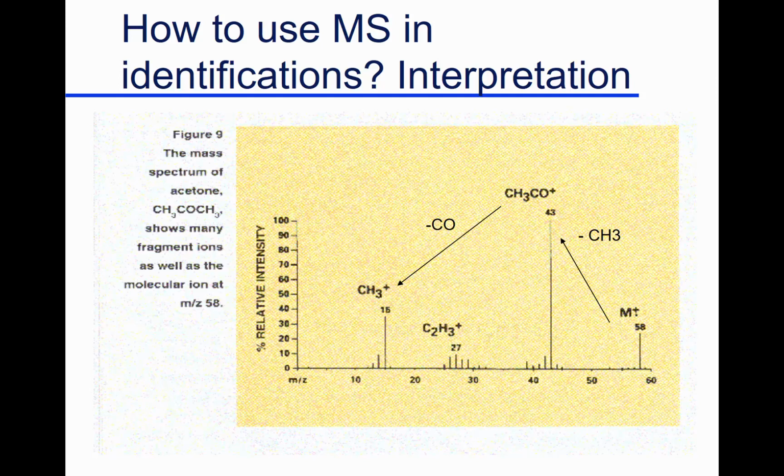Boring. But what was fascinating to me is that he started listing them, and he said, okay, here's methanol, and here's some butanol compound. And here we've got the butanol, and after that comes acetaldehyde, and then butanol again. I'm sitting there thinking, wait a minute, he listed butanol twice. Normal butanol, there are no isomers of that. How on earth do you get a peak here from your gas chromatograph and then a peak out here for butanol? And some of the things in between didn't make sense.